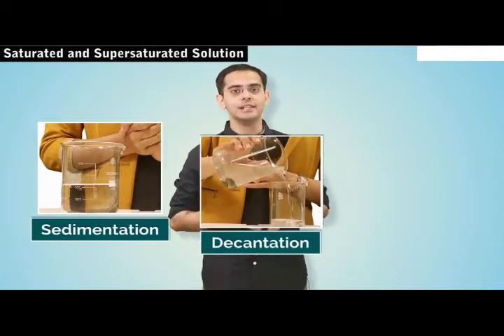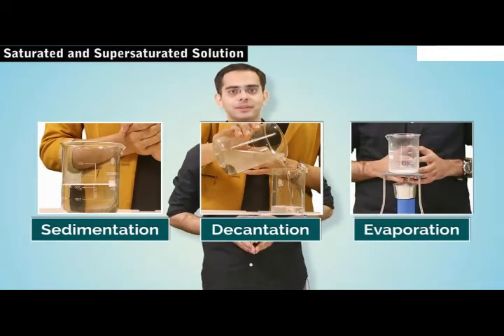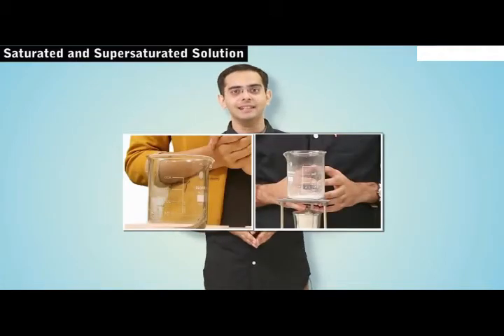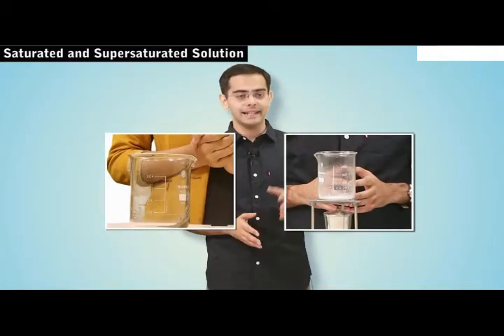Hello students, in our last module, we separated salt and sand by using the processes of sedimentation, decantation and evaporation. So here is our sand, which was the sediment, and here is our salt.